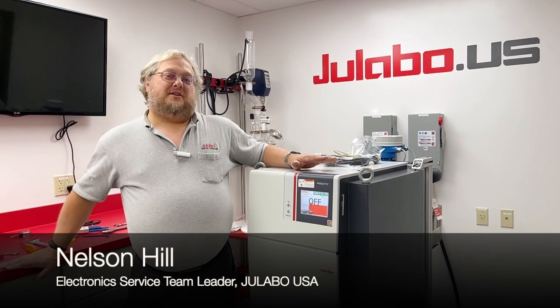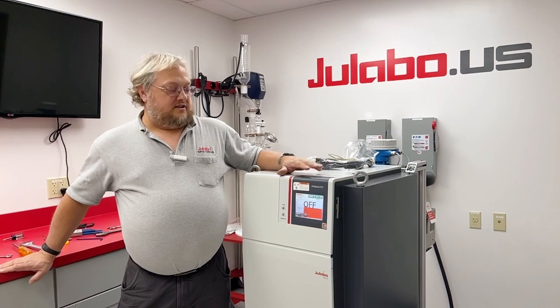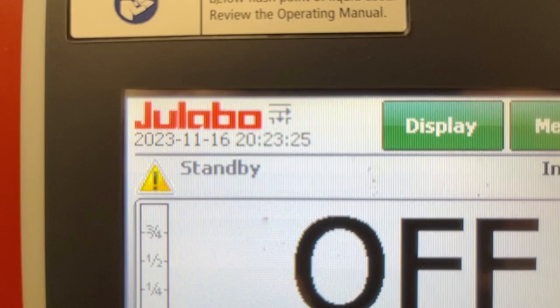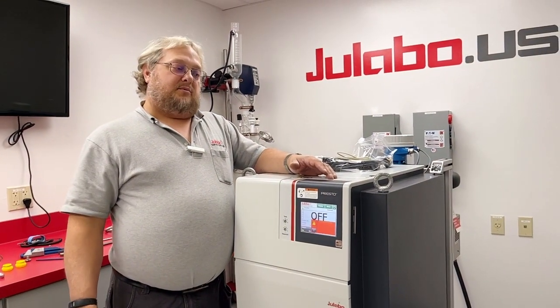So now we're going to show the menu features that are active when the Presto Flow controller is installed. First thing, there's a small symbol that appears on the top of the display that indicates that you have a flow controller connected to the Presto.